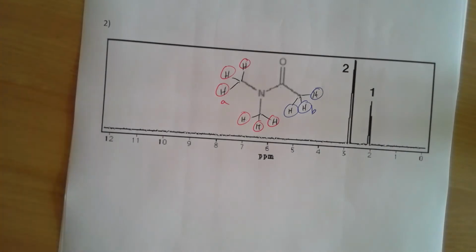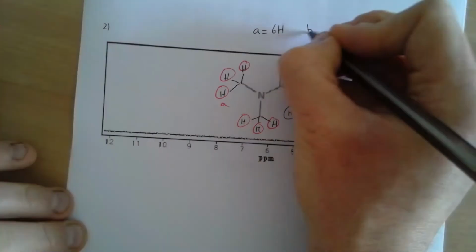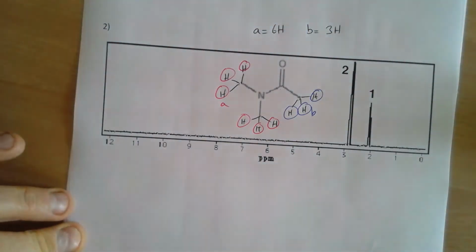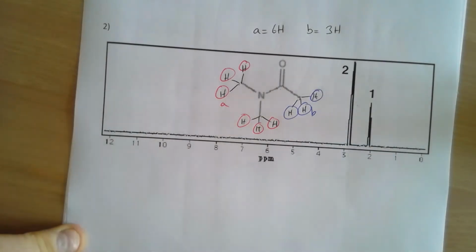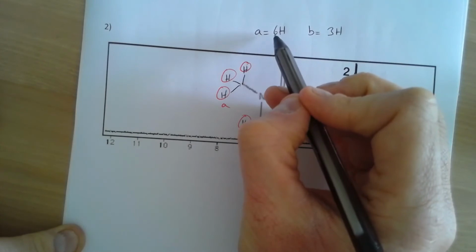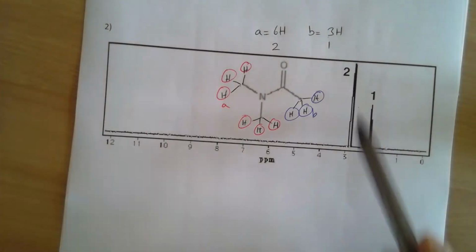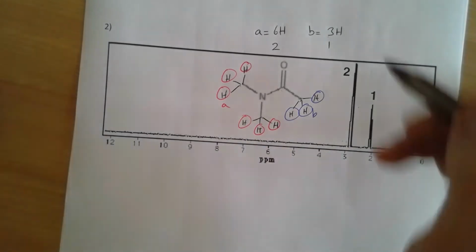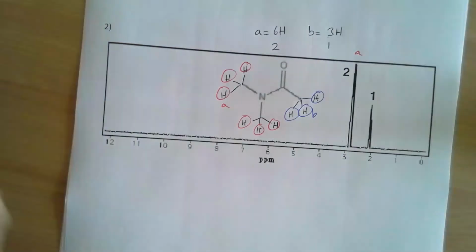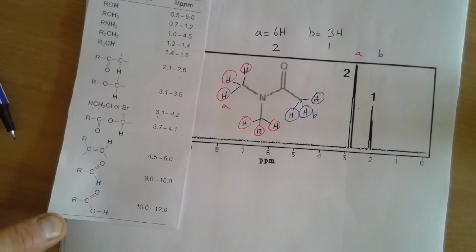If we have a look at the number of hydrogens in each, environment A is a 6 hydrogen environment, environment B is a 3 hydrogen environment, and we're given the integrals in here, but we're given integrals of 2 and 1. The simplest whole number ratio of 6 to 3 is going to be 2 to 1, so that is as we expect. So without even looking at the chemical shift, we could identify this peak as belonging to environment A and this peak as belonging to environment B. But let's check it with our chemical shift.